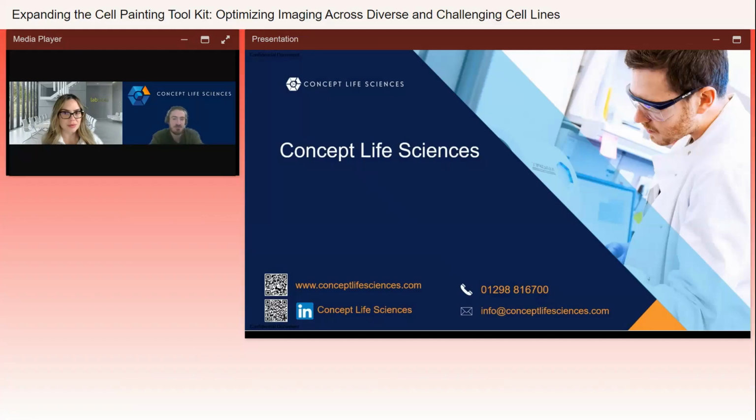It becomes something that you can quite easily catch by eye, as opposed to flow cytometry, where there's a bit more of a nuance to it. It's something that you can exclude from the data as well. So you can set thresholds in the masking software.